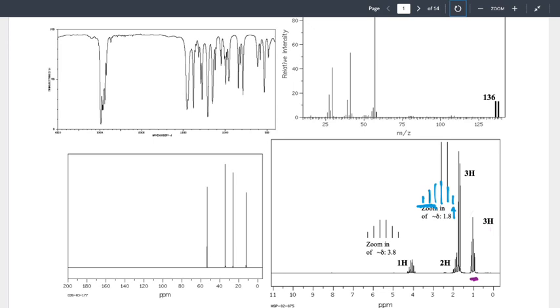Okay. What happens here? The next one, I had a CH2. And I need 4 neighbors. How do I get 4 neighbors? Okay.